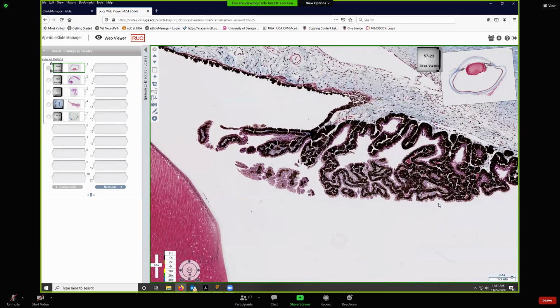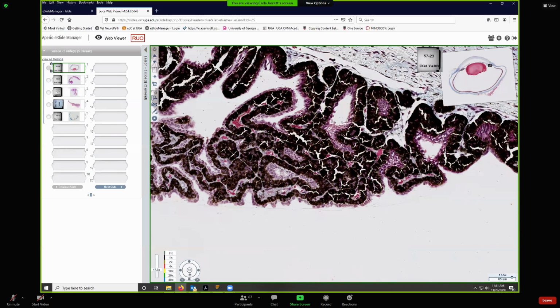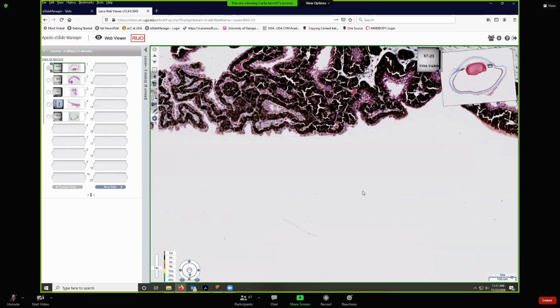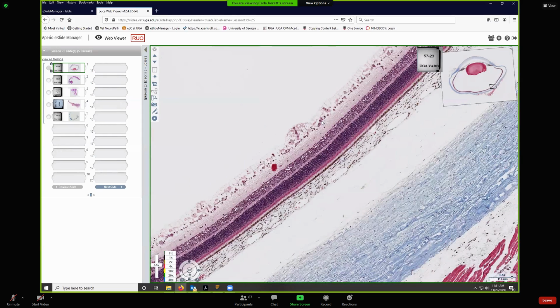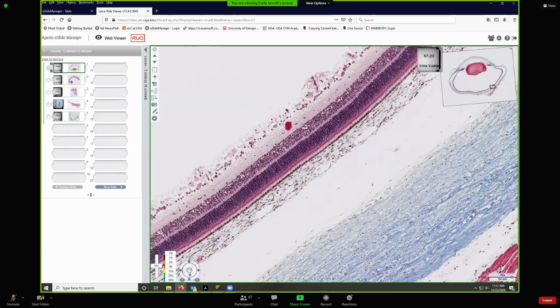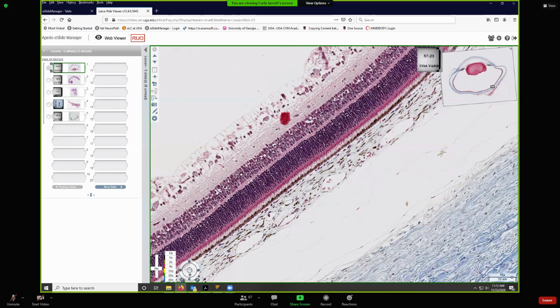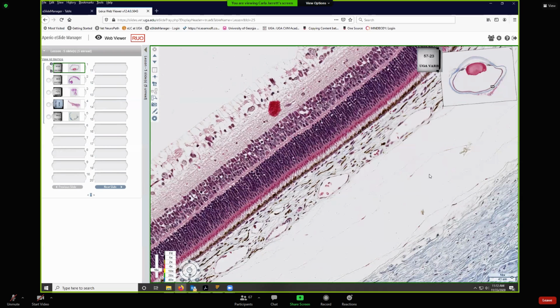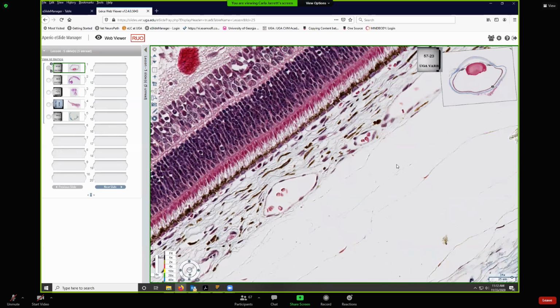And then the choroidal epithelium. Oh, the basal complex of the choroid. Yeah, that was one that was listed. So the choriocapillary layer. If you know your layers of the choroid, you've got your suprachoroid layer, and your vascular layer. Remember that suprachoroid layer is like, why did we even bother naming it? It's here where the choroid likes to pull away from the sclera.